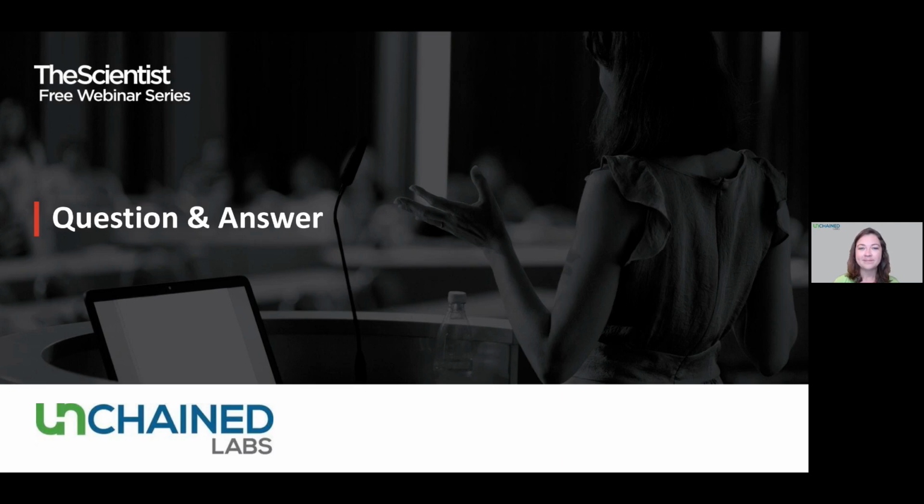Thank you. And our next question is, can Lunatic quantify protein as well? Yes, it absolutely can. It would use the A280 absorbance wavelength to measure protein. And we have a variety of applications as well for protein use cases, including unmixed applications to pull out different impurities that are more common in protein workflows.